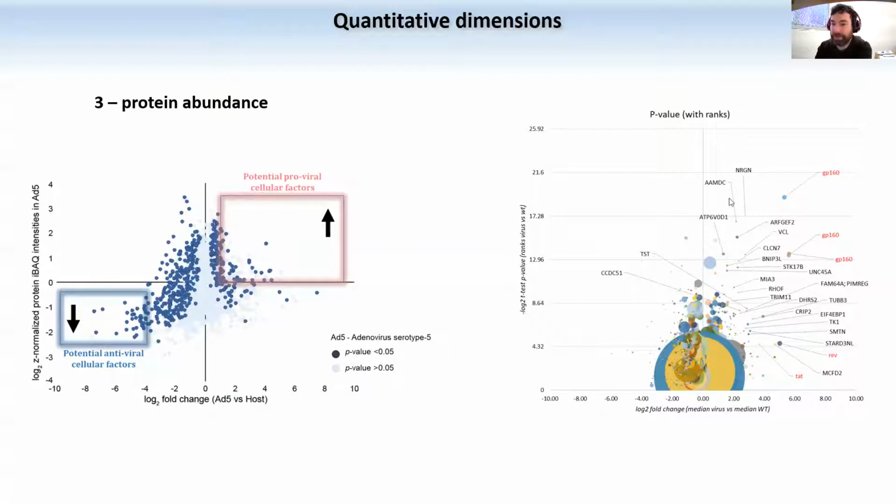So now, if you scale your bubbles by protein abundance, this helps you to choose a priority target. You see that, for example, there is a protein here that is changing, but is extremely low abundance. And here there are proteins that are changing, but they are very abundant, right? So that actually is easier to point your eye at the things that are changing and abundant. And actually, this was an HIV infection. These are the HIV proteins. So that's not surprising, but it was a good positive control.